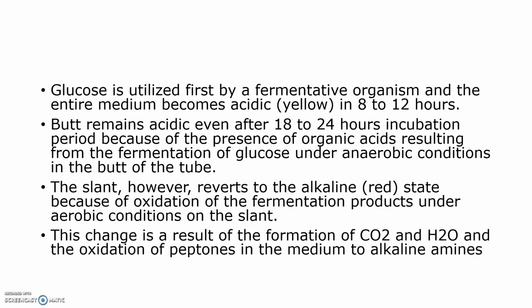Butt means the lowest portion of the tube, acidic because of the organic acids resulting from the fermentation of glucose under anaerobic conditions. So the butt is the lowest portion where the anaerobic fermentation takes place. Here it may appear yellow in color.